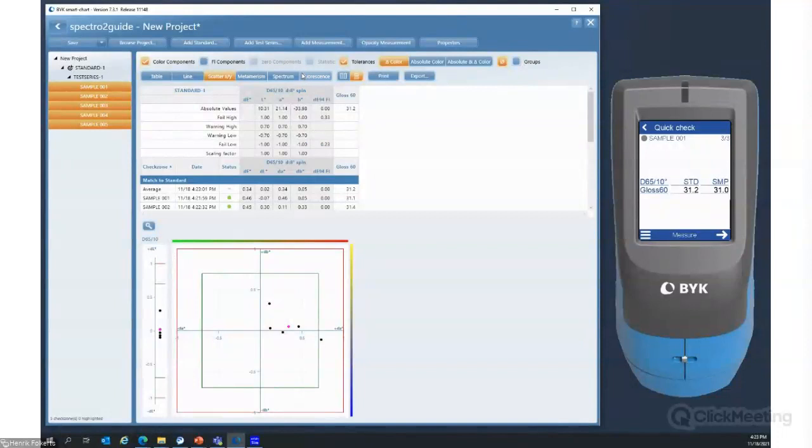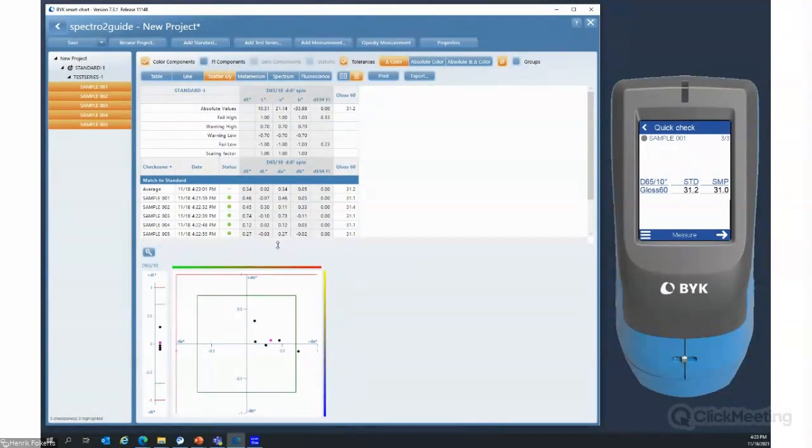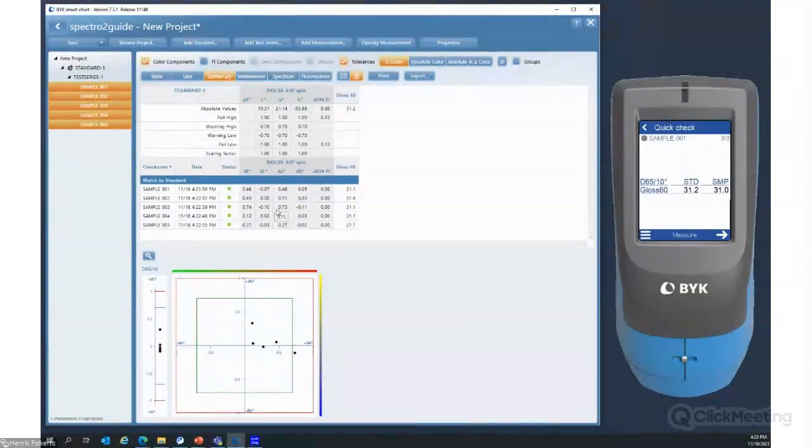And you see, without any additional input, we get an analysis, we get color numbers, and we see differences on screen. So I can make this a little bit smaller so that we see all the readings. Okay, I click on this. So the simulation creates random numbers, but not so big differences as designed.